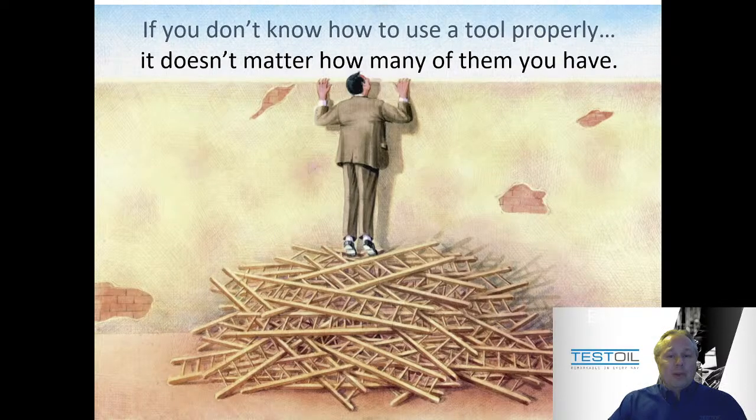And there are just so many people out there who get dozens to hundreds of samples, and they file them away, and then something goes wrong, and they look back and say, how could I have known this was going to happen? And someone with experience looks back at those reports and says it was telling you the whole time. So that's why I'd like to teach you a better way to read reports.